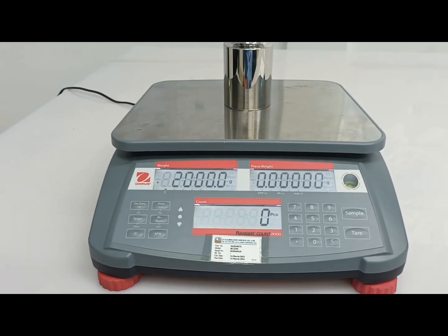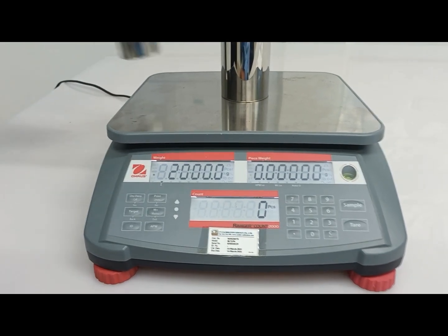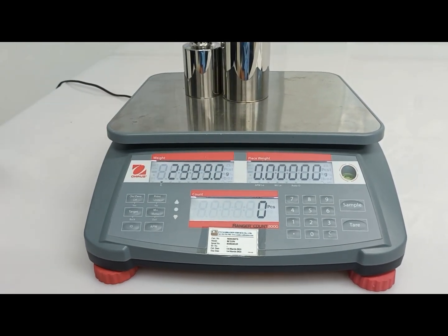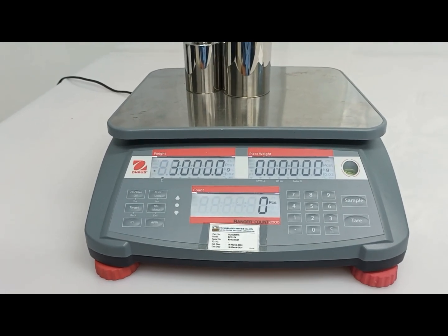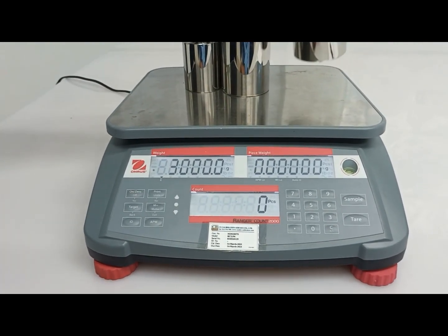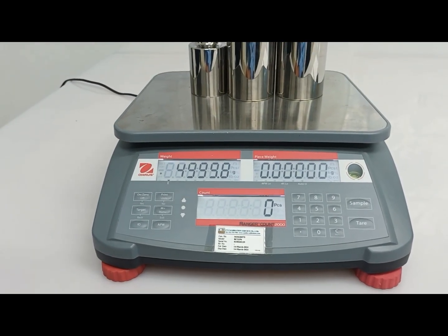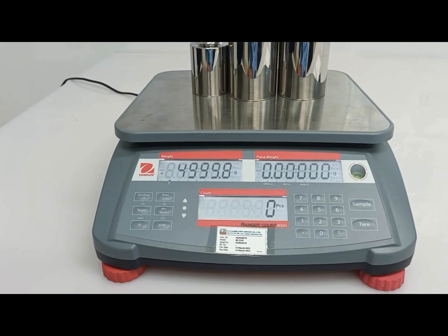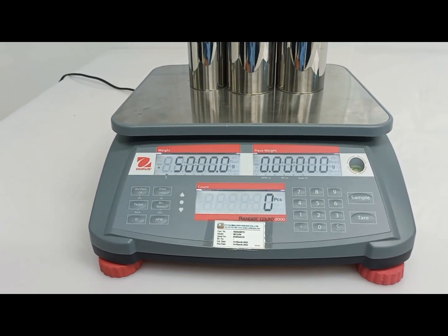I will check again. 2 kg. 3 kg. 4 kg. 5 kg.